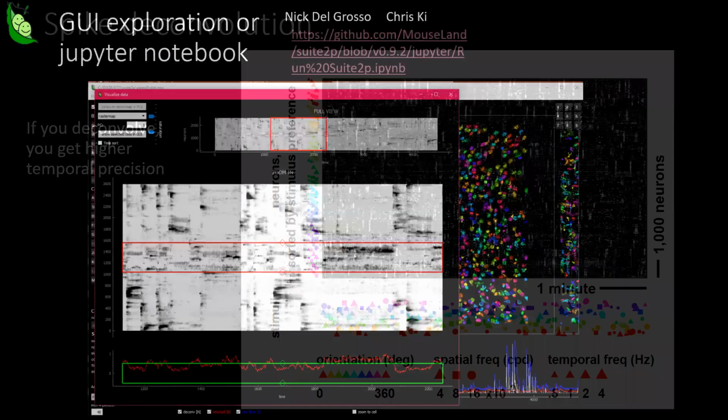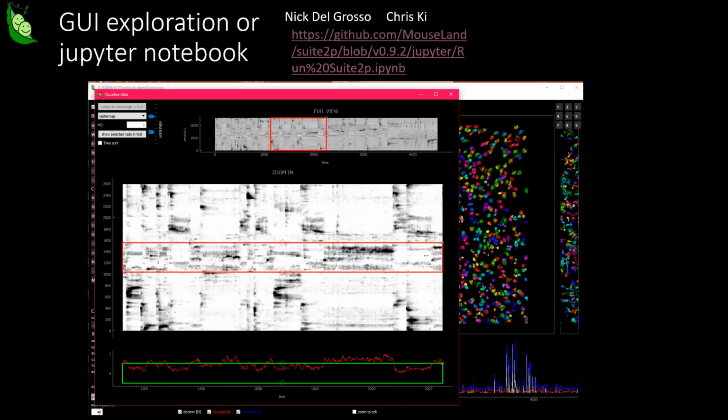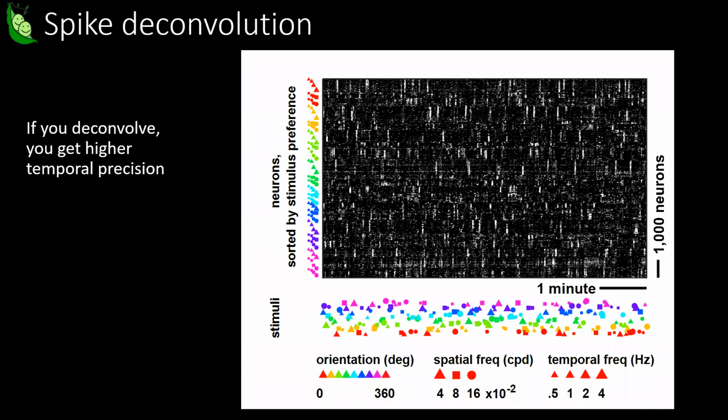All right, and so finally, Carson, could I ask a question about the deconvolution? Yeah. So I tried the suite2p deconvolution. So you get basically a continuous signal, right? And you get this spiky activity, but they have different amplitudes as well. So if you want to move to discrete spike trains, what would you recommend to set the threshold on? Yeah, so that's a great question.